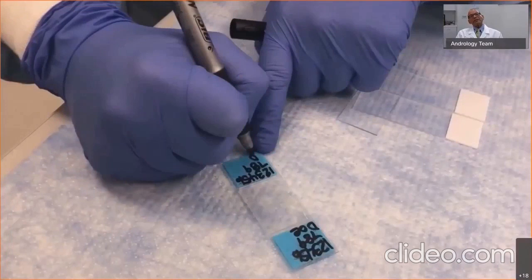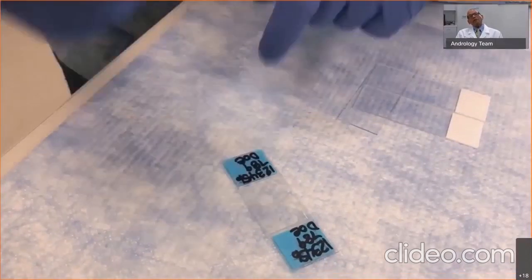As you can see, the sample has completely spread, and it is important that we label the slide on which the sample has been loaded. Next slide, please.